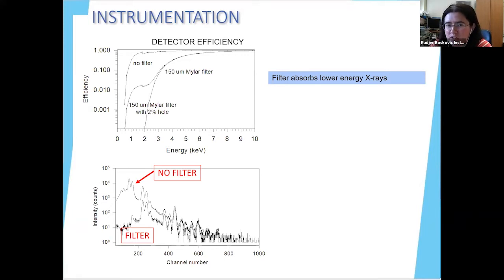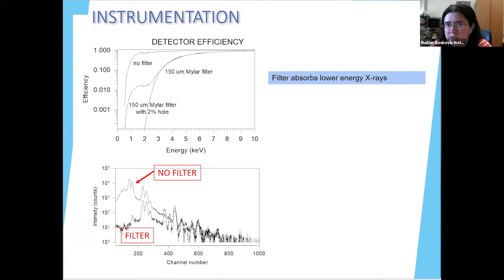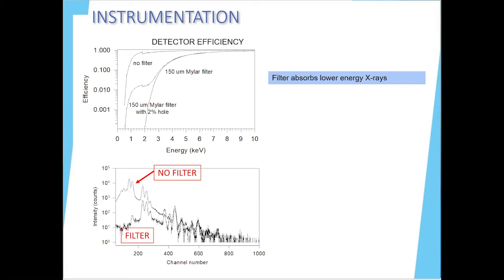So far I don't think we ever had problems. The only problem is if you have extremely low concentrations in very thin samples, for example if you want to detect impurities in thin samples. Then it can be a problem.